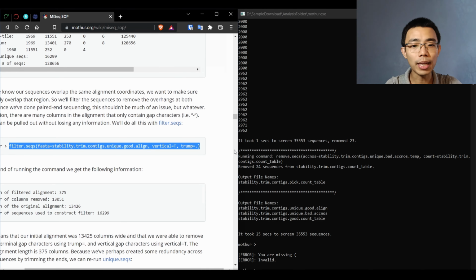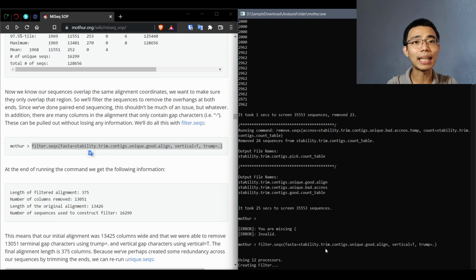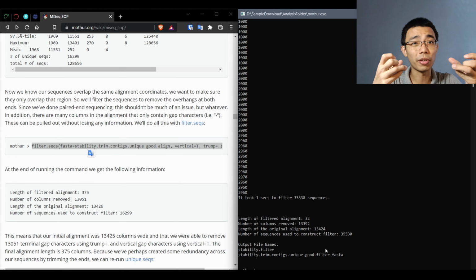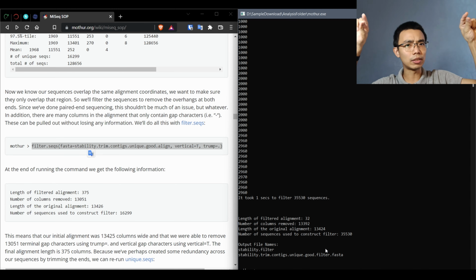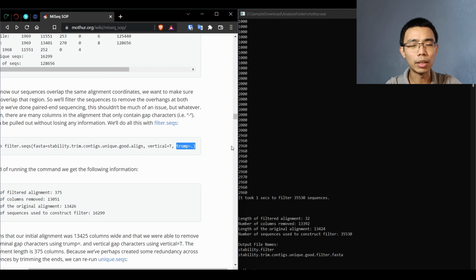So next, we're gonna filter them. This is more or less a data cleaning step, because when we align and do the filtering just now, it introduces a lot of gaps inside our sequence. When I align, the reference is usually longer and whatever your sequence is, it's shorter, so they'll align to different things and result in a number of wasted spaces in between. It's kind of like a sparse matrix. So filter sequences just filters out all the, what is that called, the dash characters up there.